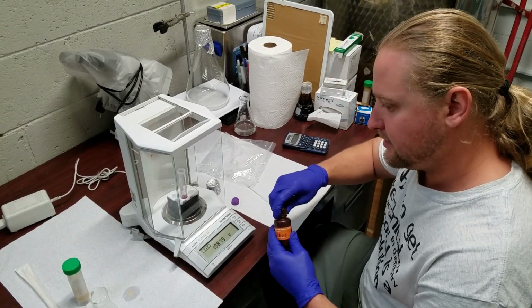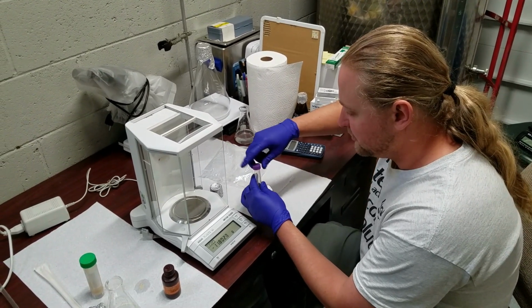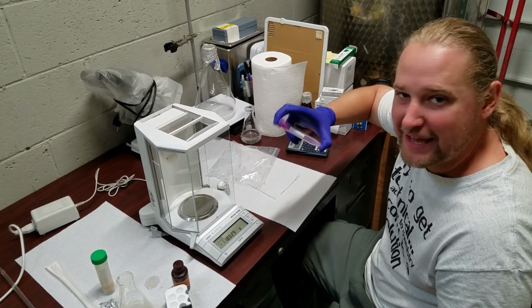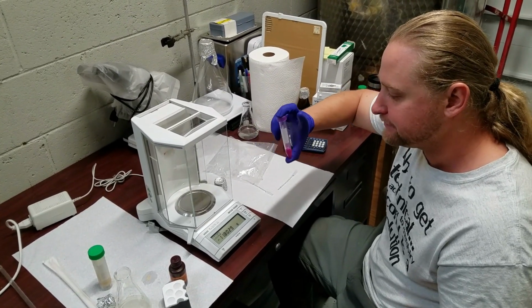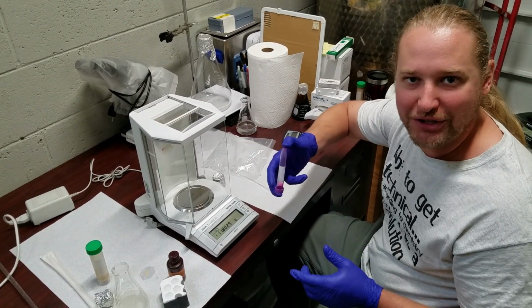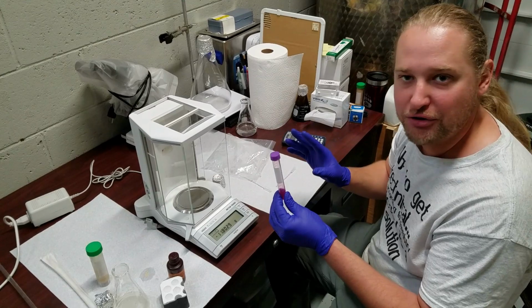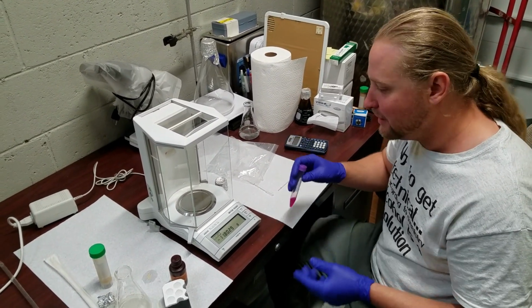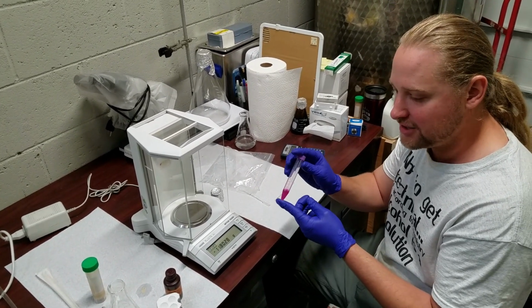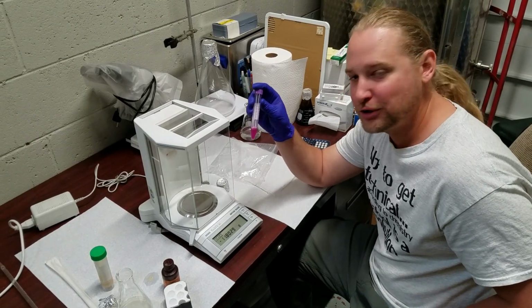All right. So after you've got the 1-to-1 dilution, you're going to be sitting at a 120-fold dilution. And you just want to turn this up and down about 10 times to mix that methylene violet into the yeast. This way, if you ever have a problem seeing what cells are alive or dead, you'll always be able to tell. It gives an awesome dilution under the microscope. I like doing 120-fold instead of 100 because I have to count fewer cells under the microscope. It still gives me a uniform number, and it's an awesome look for viability as well. So that's how you get a 120-fold dilution by weight.